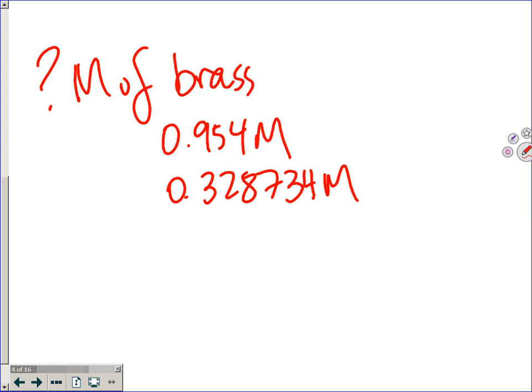All right, guys, listen. Drew, can you cut the fume off for me? It's one of the switches. All right, so listen as you go. You may come back during intervention after school. I'll talk to you guys, but if you don't have a molarity, then use one of these people's to do your calculations. Those are going to be the data points that you can use for the final calculation. Okay.